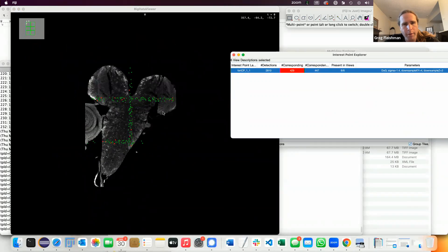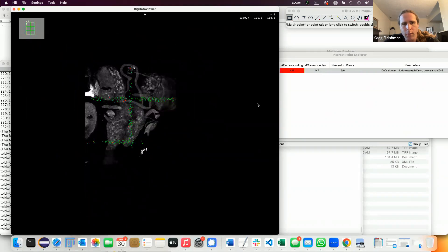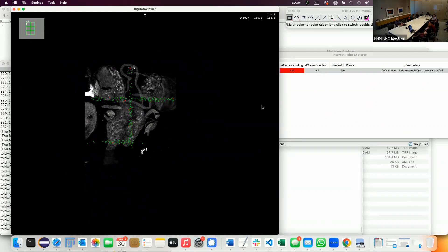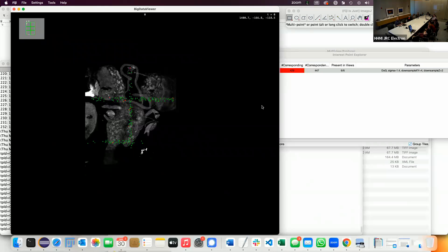Question: why are there points in non-overlapping regions? The interest points that were matched are in overlapping regions, but it looks like detection also ran in the interior of tiles. That's a fair point — it runs for the entire image because it could also be called for chromatic aberration correction, where you need it everywhere. It wouldn't save a considerable amount of time to ignore the rest in this small case, but for bigger datasets it would. That's actually a good point — we should add that optimization to limit interest point detection to the overlap region, maybe extending by 10%.